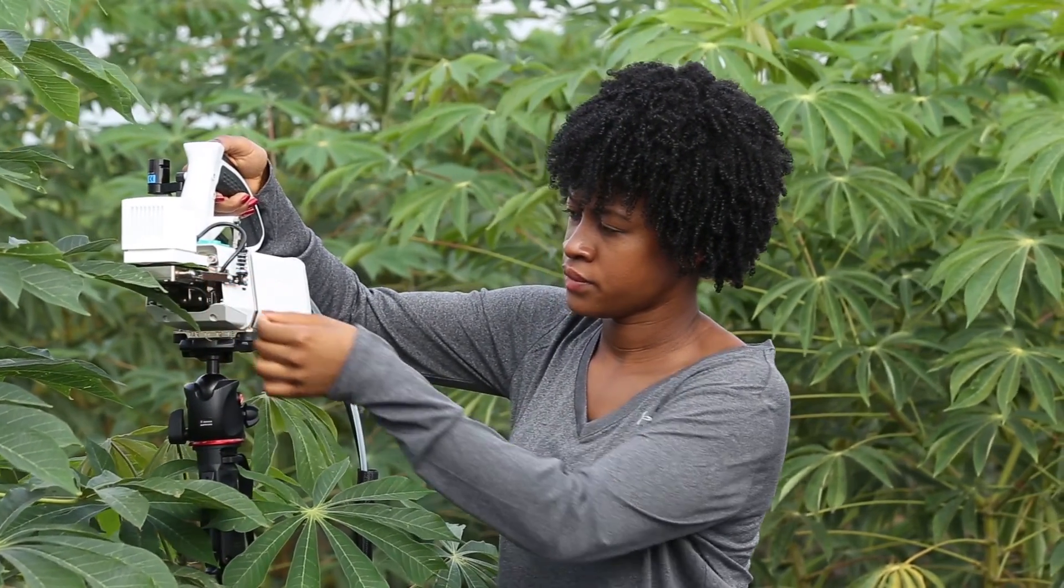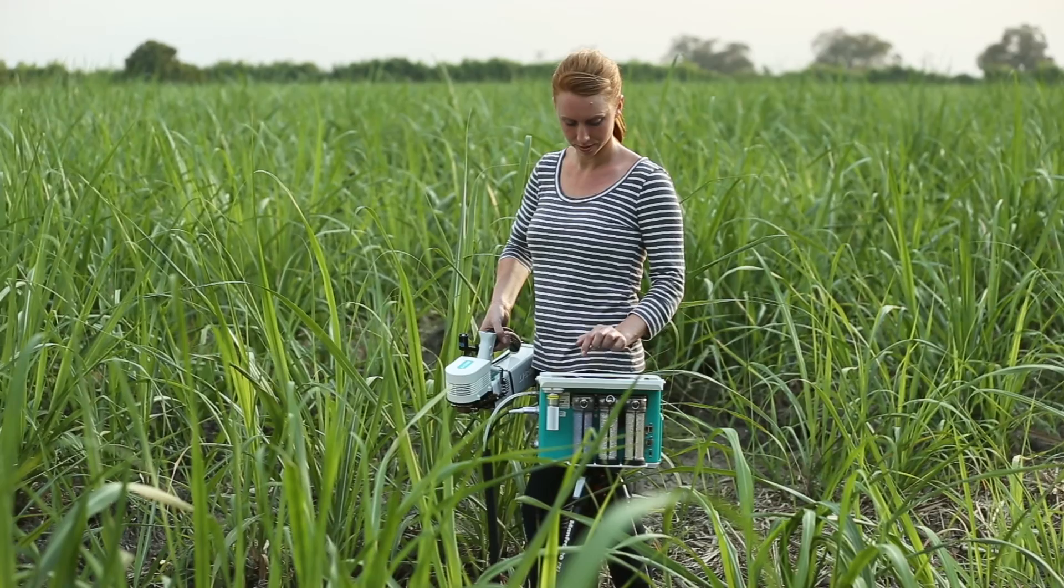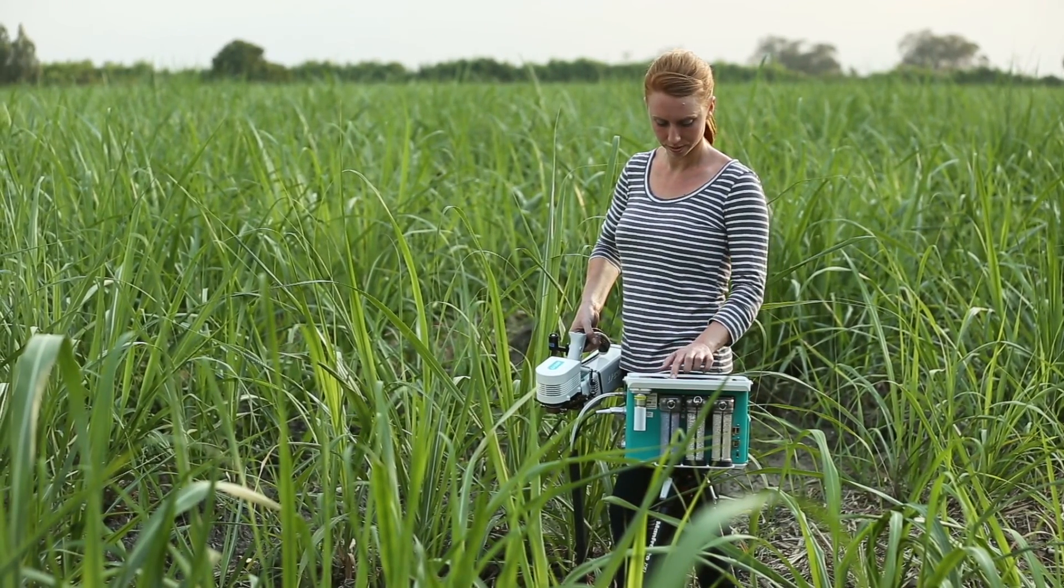The advanced technology and attention to detail that comprise the LI6800 can reveal more about the biology of photosynthesis than ever.